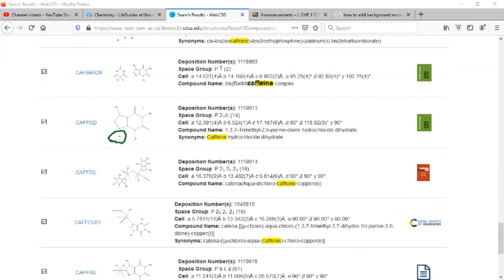Now, just for example, I've had a lot of questions about this. Some of the questions ask for the space group. So if you're given a space group that has a subscript, say P21 upon C, you would just write it as P21/C. You don't have to use any subscripts when writing the space group.